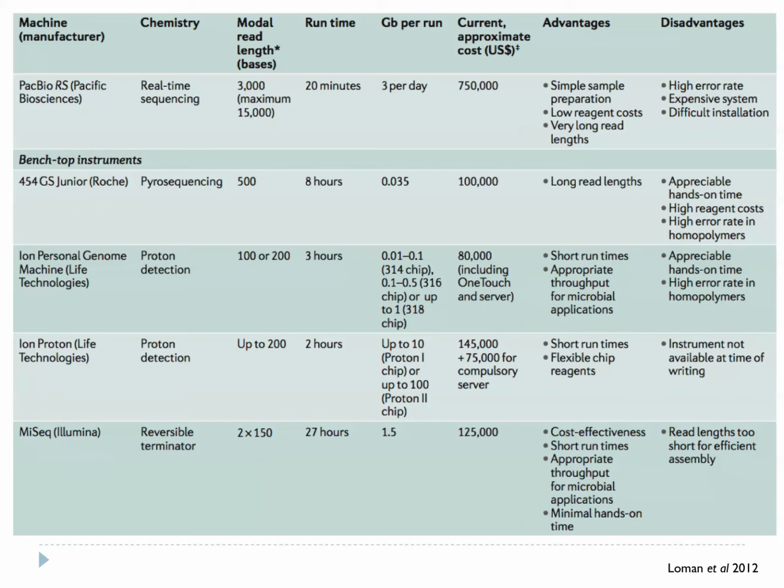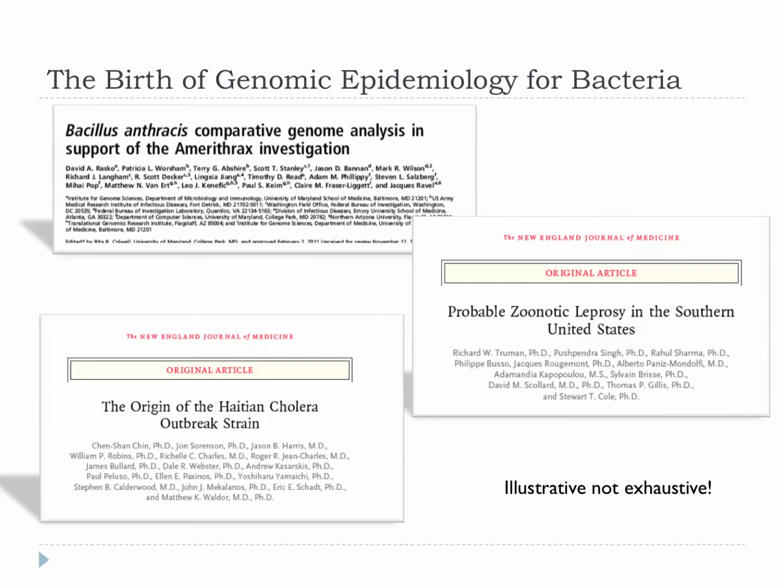I just pulled this table out of the paper as well. This summarises the benchtop instruments and PacBio. And again, it's a rather busy table. I'm not going to go through it in any detail. But the key point is that there isn't an ideal technology for microbiological applications. Each technology has advantages and disadvantages, and it all depends on what you're looking for in terms of performance and throughput and read length and so forth. I'll say more about this in a short while.